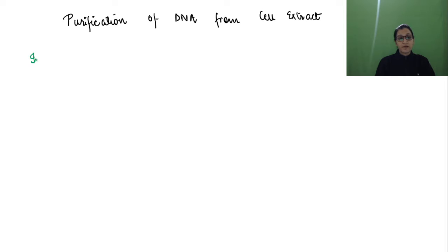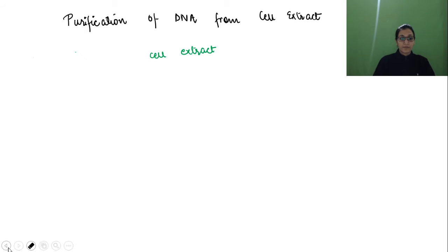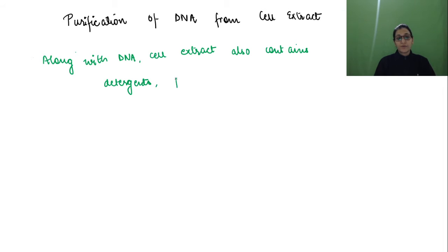Along with DNA, the cell extract also contains detergents, proteins, salts, reagents, and RNA.